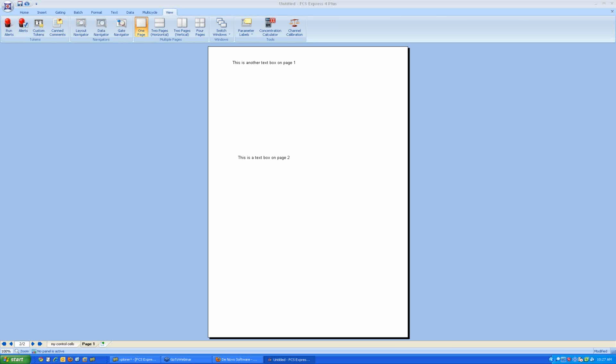One thing I do want to stress: if you do have a layout from version 3 that for some reason doesn't work, there are probably, conservatively, 50,000 layouts created in FCS Express version 3 at this point. Please contact us. Don't get frustrated, don't get annoyed, don't say it's broken. Just contact us and send us the layout, and we will make sure that version 4 is fixed so that it works. Our intent is compatibility, and I think we've done a very good job, but there could be some incompatibilities left, and we want to work with you on that.